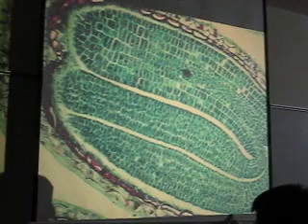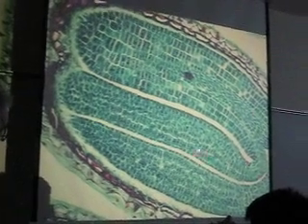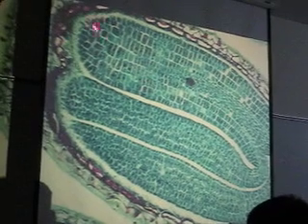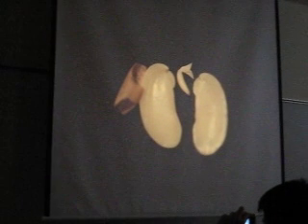Okay. Maybe you'll be lucky to find one like this. Cotyledon, and oh, off the side, I can't see it. This was a beautiful stem tip. Hypocotyl, radicle. Radicle, hypocotyl, two cotyledons. Whole thing is a seed. Okay, then you have some bean seeds to open up. I'll show you where they are.